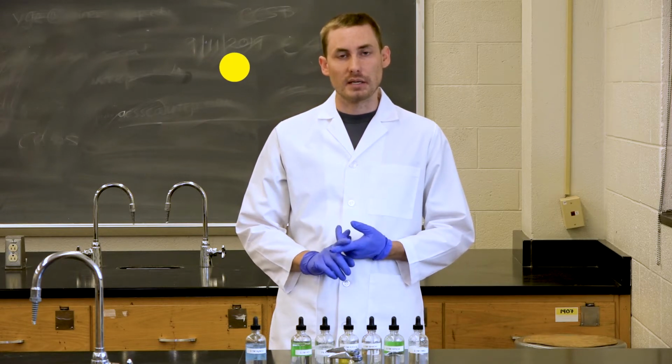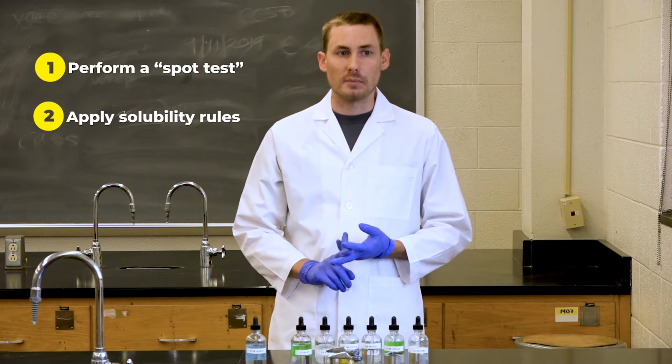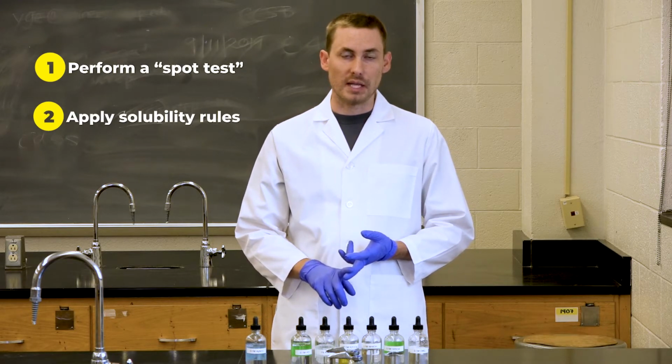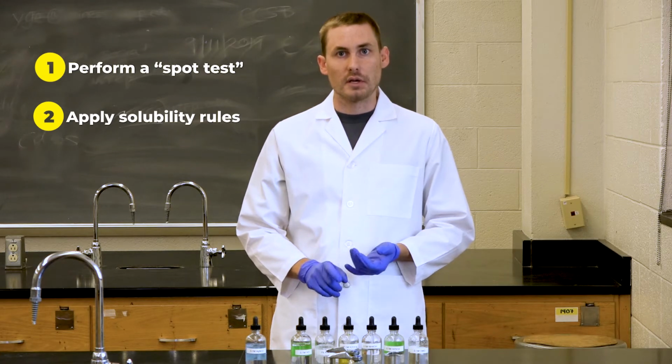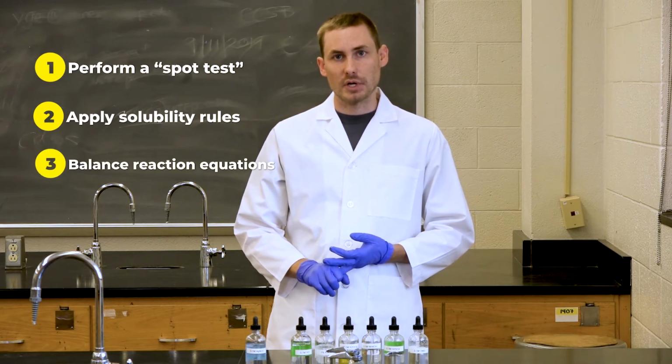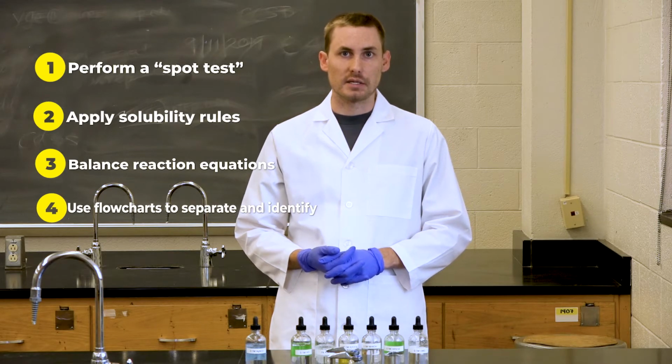The first being how to perform a spot test. The second is about which solubility rules will apply to a certain solution and what solubility rules are. The third is how to balance chemical equations, and the fourth is how to use a flow chart in qualitative analysis to determine which ions are in a mixture of an unknown solution.